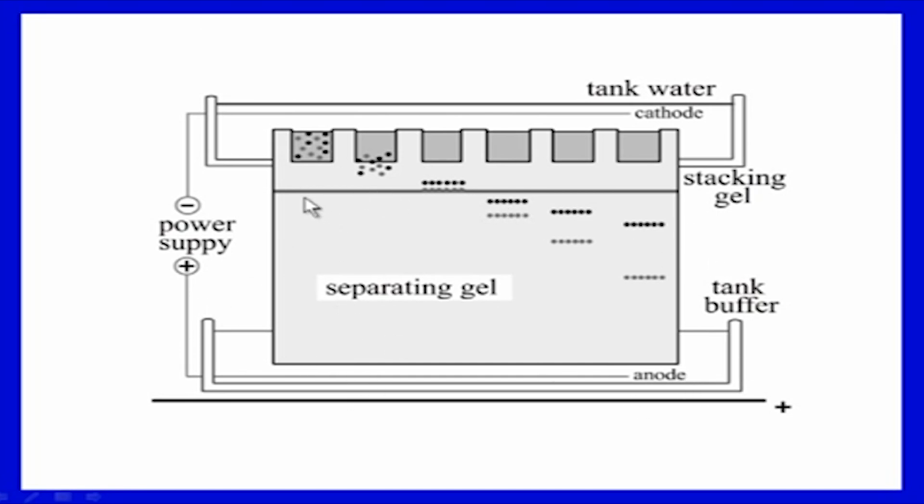If you can see, most of the plate is covered with separating gel, and there is a very small part of stacking gel here. You load your samples in these wells, and these samples are distributed here, big, small, but they form boundaries here, thin zones. When these thin zones enter the gel at the interface into the resolving gel, they will separate according to their size and charge. So, this is how the discontinuous system works actually, and it is very well depicted here.